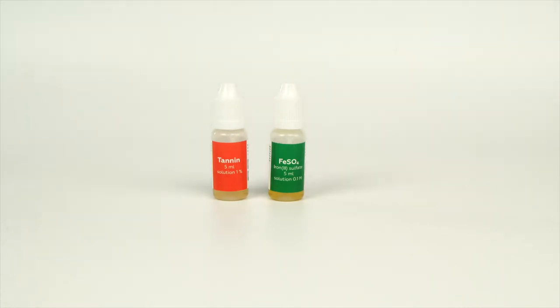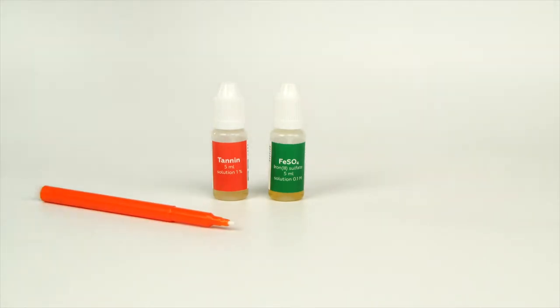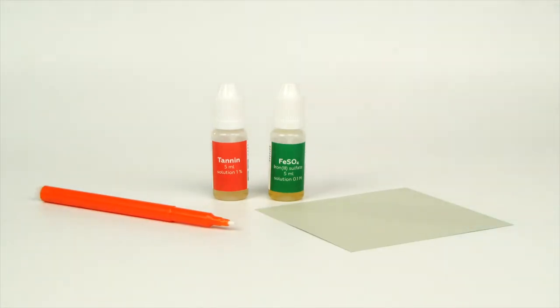For the Iron Gall ink experiment, you will need solutions of tannin and iron sulfate. Take an empty marker, a piece of paper, and a cotton absorbent from your experiment set. Take a disposable plastic cup from your starter kit.